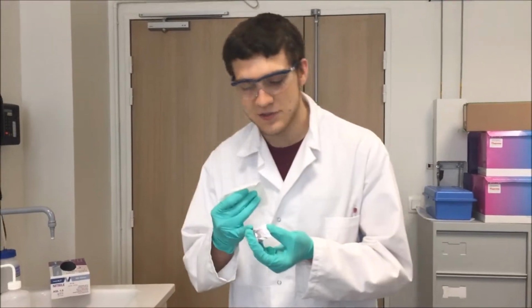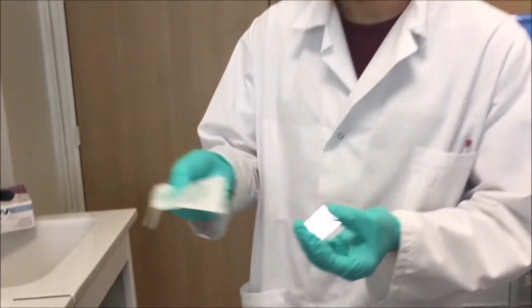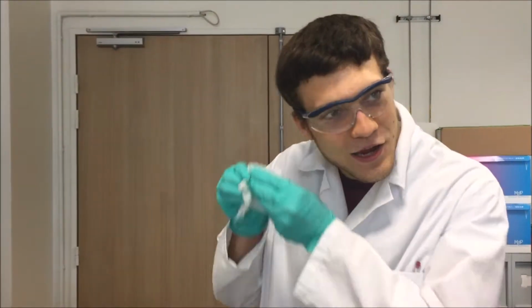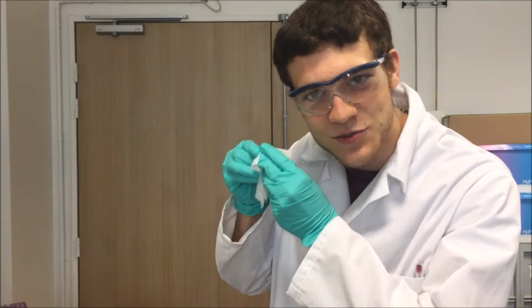Hey everyone, we're going to make some zinc oxide nanowires today via hydrothermal synthesis. And the first thing we have to do is get this silicon substrate nice and squeaky clean. So we're just going to clean it with some ethanol. And you can really hear the cleanliness here. Get that nice little squeaky sound.